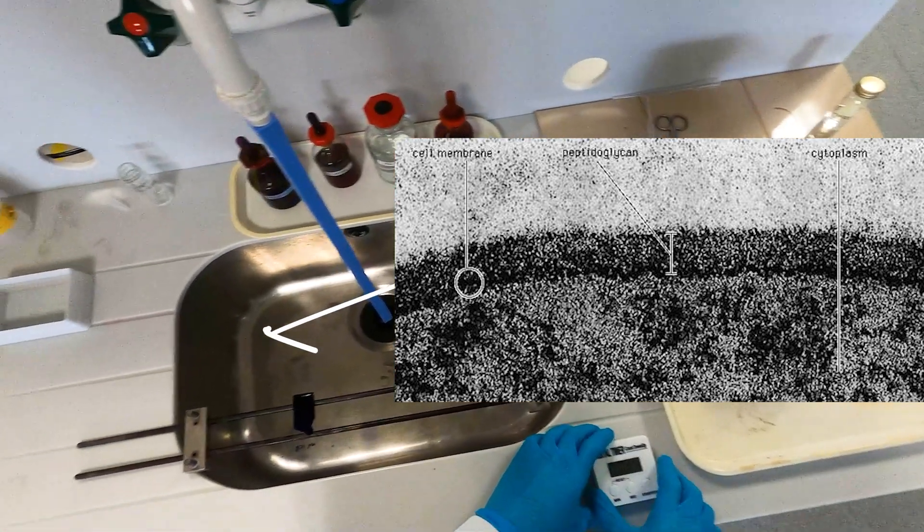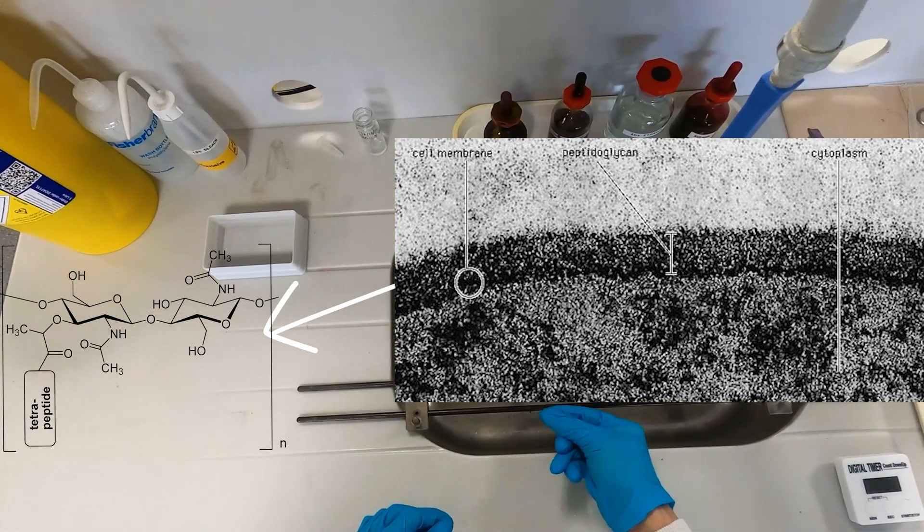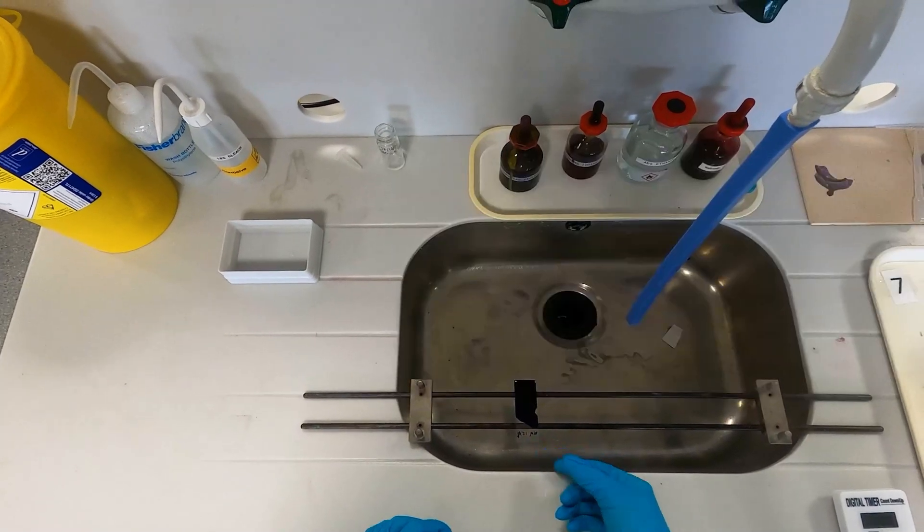The Gram stain allows us to differentiate bacteria by the components of their cell wall. Gram positives have more peptidoglycan in their cell walls than Gram negatives and therefore stain differently.